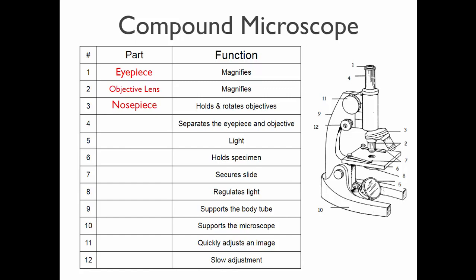For the microscope, can you see it in 40x? Like, can you see cells in 40x? Yes. Then what's that one? For this one, this is for seeing larger, not... I know, but what magnification does it go to? Ours go to 30x. So this body tube that the eyepiece is attached to just allows light to travel through. They have to be a certain distance apart to focus properly. The light source is down here. Different microscopes have different types of light sources. This has an LED light source. This is also battery power. Other microscopes, this one is not battery power. It has to be plugged in. This has a battery. You can recharge it. This microscope, this is an old picture. Do you know what this is? It's a mirror. Older microscopes used to have just a mirror here. And you would have a separate light source that you would attach, shine at the mirror, and it would then reflect the light up. These are a lot easier to use. So this is called the light source, whatever is down here.